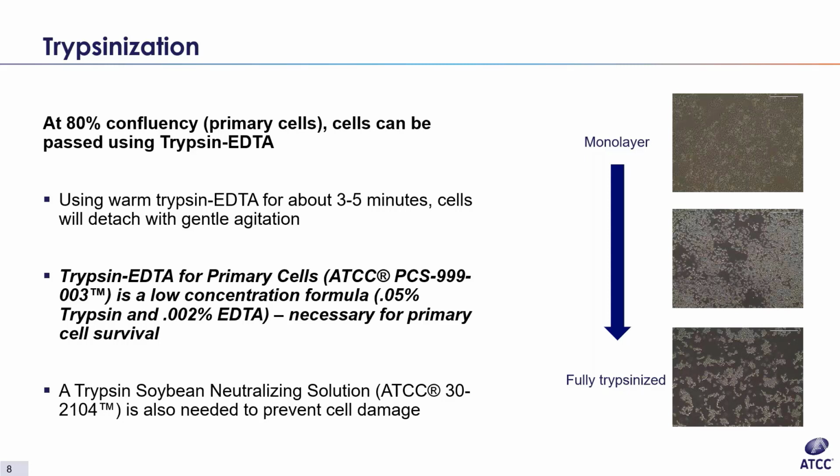This should take about 3 to 5 minutes, but make sure to note that the dish should be gently agitated to help detach the cells, otherwise it could take longer. Long-term exposure of trypsin to cells can be detrimental, so the time in trypsin needs to be minimized.